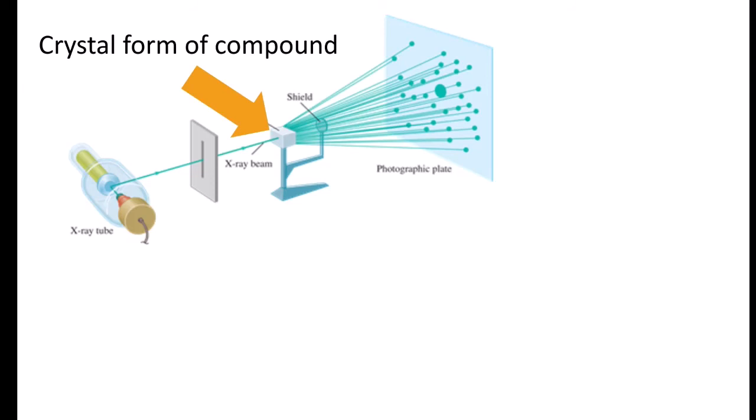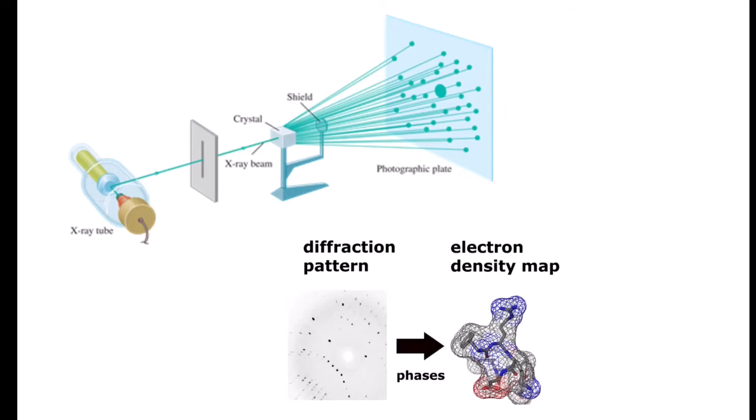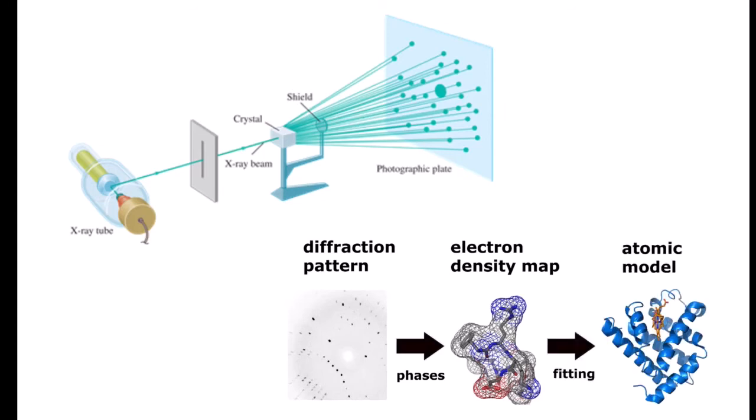I think you all know that light that passes through very tiny slits will get diffracted, so you will end up with a diffraction pattern that is projected on the screen. So given the diffraction pattern, scientists will now be able to reverse calculate what the 3D structure of the compound is that gave rise to the particular pattern of diffraction. So that is the purpose of X-ray crystallography.